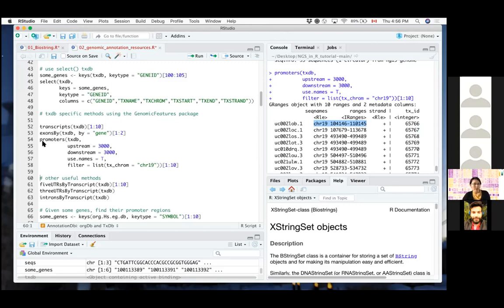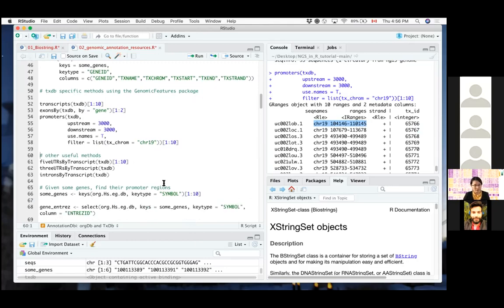This is quite useful if you are involved in doing any kind of genomic analysis. A lot of times you have to define promoters of the gene, for example, or you want to extract the first 2000 base pairs of a gene, or the last exon of a gene, or the 10 kb downstream of a gene, which you could all very conveniently do with these built-in functions.